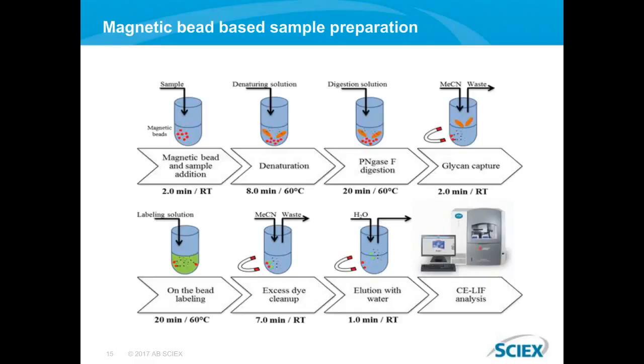One more important part of this is that we are doing all of these individual steps in a way that is completely liquid handling robot friendly, which means if you would like to use a liquid handling robot, you cannot really cap these vials.